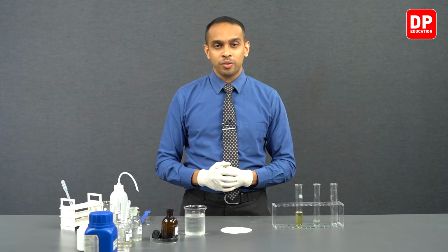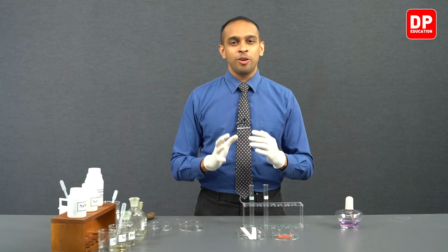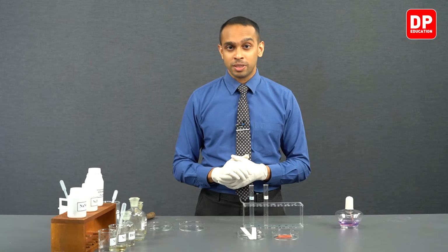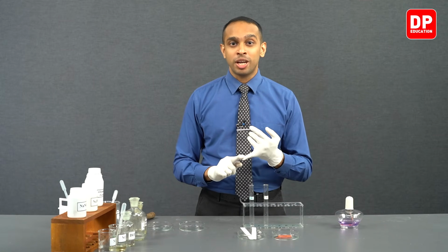Now let's move on to the next test. Students, we are going to observe an identification test that can be conducted to identify the presence of both nitrate ions and nitrite ions. So this test can be used to identify both nitrate and nitrite ions. That means you can't use this test to distinguish between two solutions of nitrite and nitrate ions, because this particular test answers to both nitrate ions and nitrite ions.